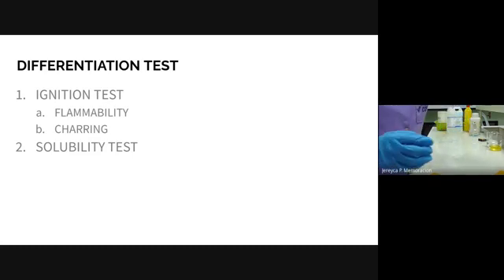Because we are producing a flammable gas, it's better for us to have a heat resistant plug. We are going to use just drops only.